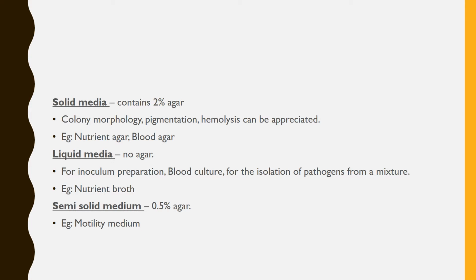So what is solid medium? Solid medium has a 2% agar concentration. The advantage of solid medium is that we can see the colony morphology, where we can see pigmentation, hemolysis, and so on. Examples of solid media are nutrient agar and blood agar.